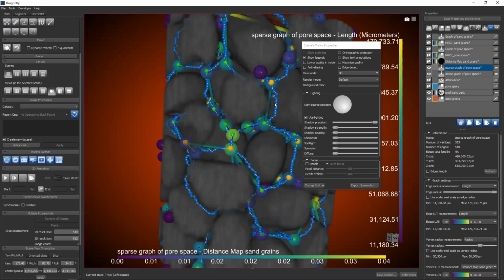Next question, is there a limitation on the size of the stack for doing the graph? That's a great question. We have not done that scalability analysis. I'm going to ask one of my colleagues if we can do that and figure out what's the maximum image you can take. It's probably related to the complexity of your ROI that you start with, or maybe how big the biggest pores are. We're going to have to look into that. It's a very good question, and I hope we can readdress that. What's the biggest input you can use for generating a new graph?